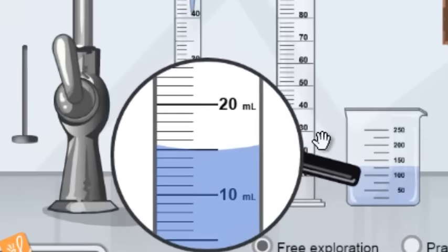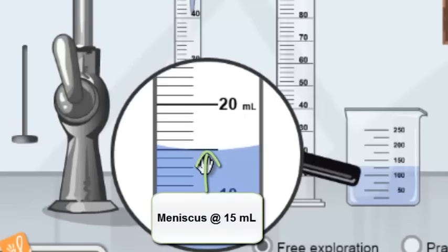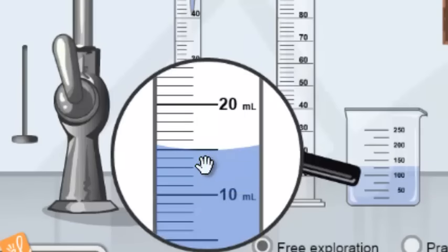Alright, and that's it. Like I said, I asked you to fill this up to 15 mils, and if we take a look at the water we'll notice that the top of the curve is above 15, but the bottom, the meniscus, what we're supposed to be reading, is touching 15. So I've accurately measured out 15 milliliters of water. That's how you can measure out a proper amount of water using a graduated cylinder.